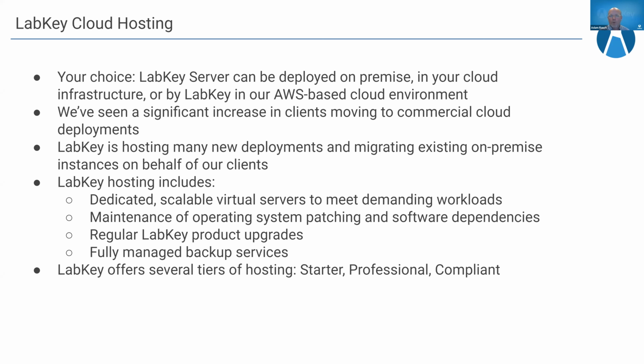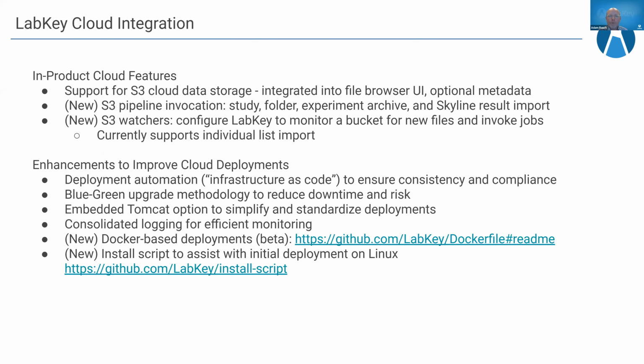And then in addition to hosting LabKey, we have built a variety of different capabilities within the product and around deployment of the product to make LabKey work better in the cloud. So for a long time, we've supported S3-based data storage, integrating that with the file browser user interface, allowing you to copy files to and from the cloud very easily, just with drag and drop, and add metadata if you want. That's been a part of the product for a long time. What's newer is the ability to invoke pipelines on S3-based documents and files. So study import, folder import, experiment archive, and Skyline import can all be done from S3.